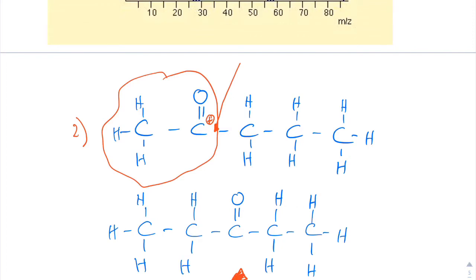So if I add this up, carbon is 12 and 12, so we've got 24, and 16, and then we've got 3 hydrogens. What are we at here? This is 43. All right, I think so, 43. Yes, 43.